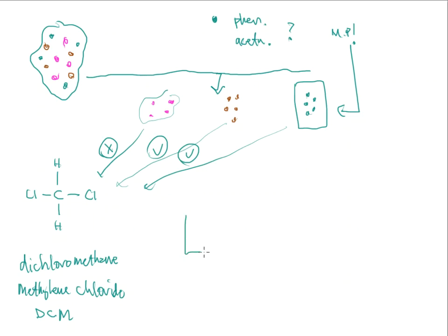So what I can do is take a beaker or a container and put my mixture here in the bottom, and then add my methylene chloride, my DCM, into that beaker, and stir it up. And everything in here is going to dissolve except for the sugar. The sugar will stay as a solid. It will not break down. And then I'm going to pour that solution through a funnel.